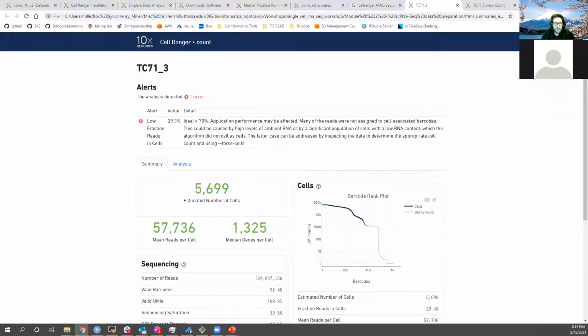So Wes says that they tell you to do MiSeq or NextSeq on low reads before tossing your sample on the NovaSeq. I have not heard that. They were definitely telling us, I think, to do the NovaSeq primarily, although we're used to the HiSeq. Yeah, there have been a few white papers that have come out where they talk about the differences between the different sequencing machines and how well they perform, which are very interesting. But I hadn't heard that they were now telling people to do that. It's very interesting.